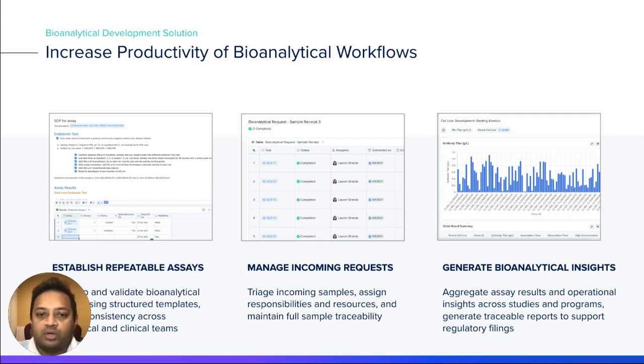We know that teams work with large complex data sets. These can be aggregated by searching within Benchling Insights. With a line of sight to regulatory submissions, the bioanalytical solution provides end-to-end traceability for sample lineage and experimental context. We also found customers reported a 150% increase in ease of finding data and metadata by working within Benchling.